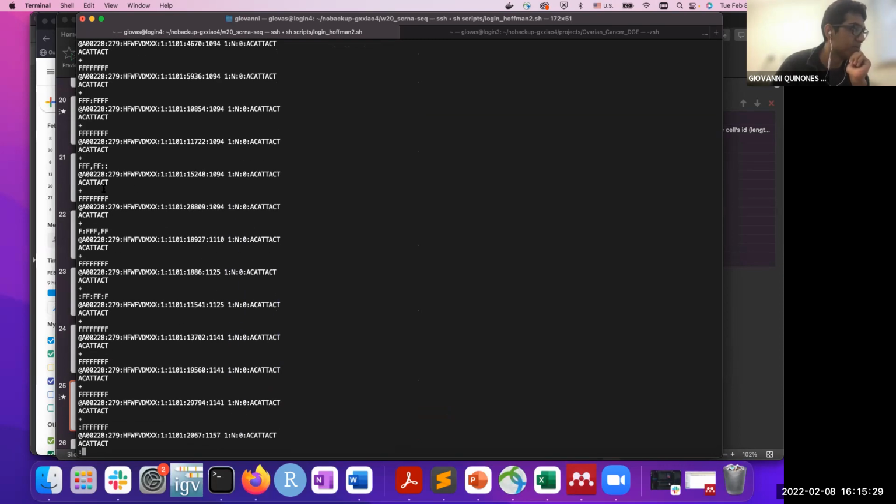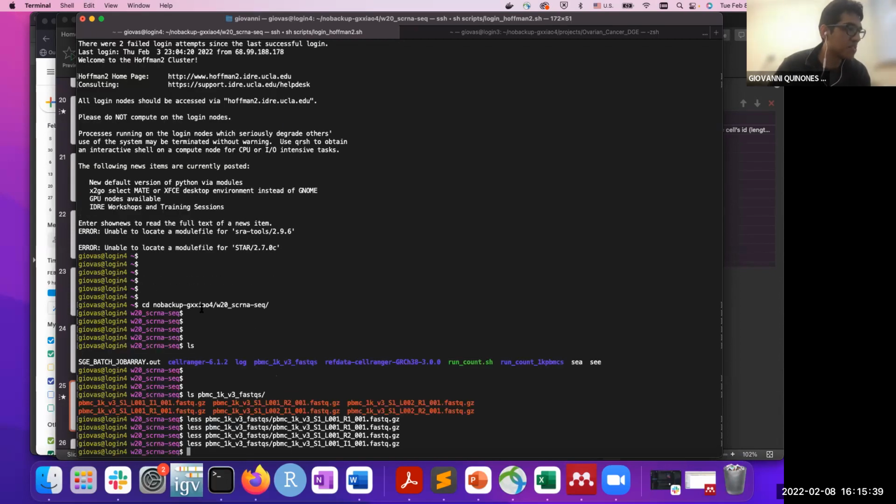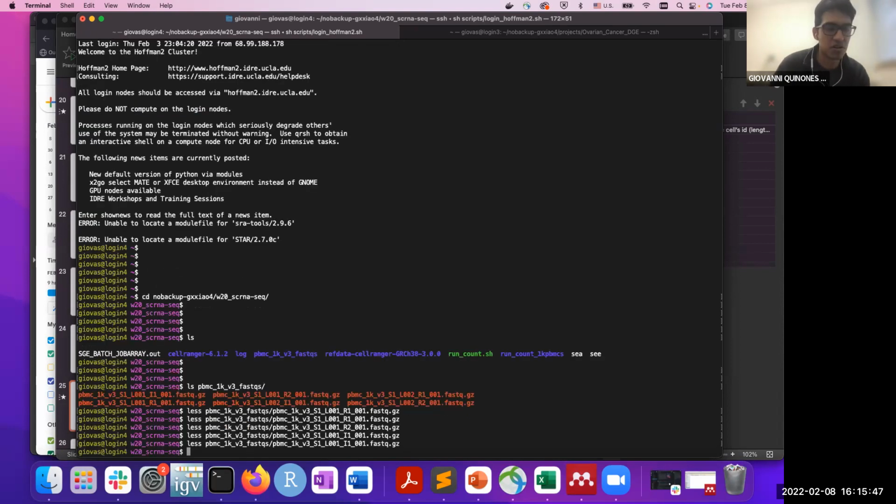There might be some mismatches, but they all come from the same sample. The way they are linked together is that a particular read has the same name on all 3 files. Hopefully this won't take very long because these are very big files.